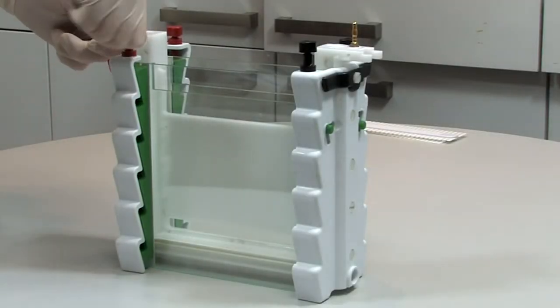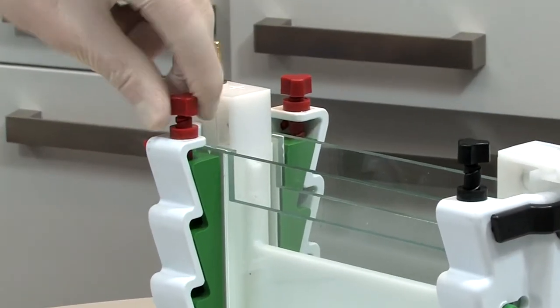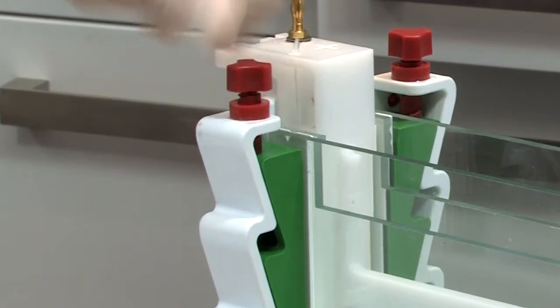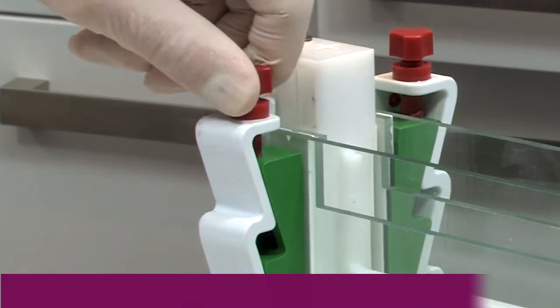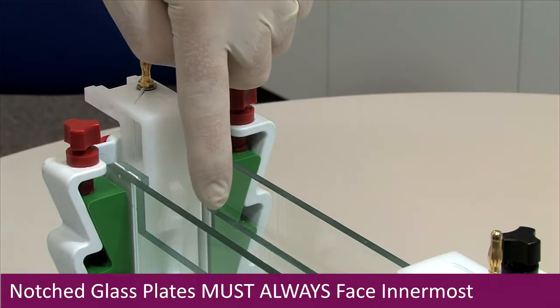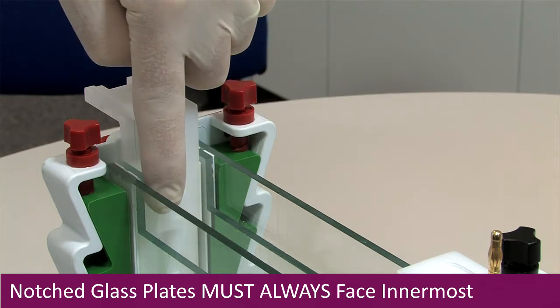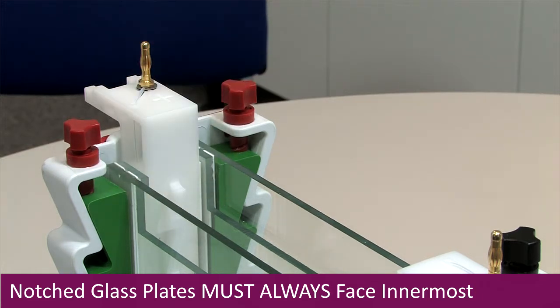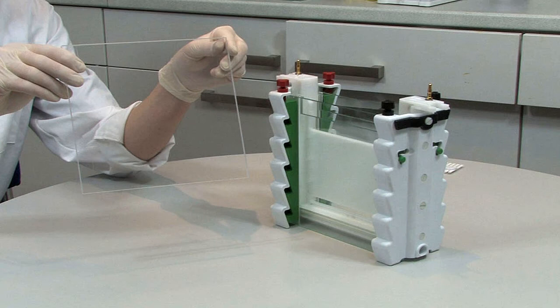Turn the red and black screws. These will push down the green clamps to secure the gel sandwich against the gasket. Insert the dummy plate if only casting and running one gel.